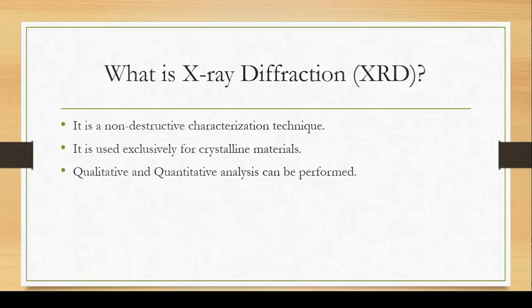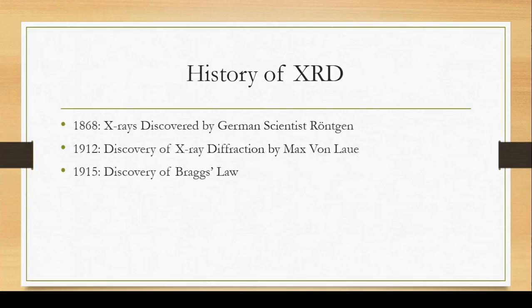So what do you mean by characterization? Characterization is to do with how to study a material, so we're looking into its properties. And non-destructive means it doesn't cause any damage to the material surface. And the second point is why I said crystalline here. Well, you'll see shortly. Before I proceed with how it works, we should look into its history.